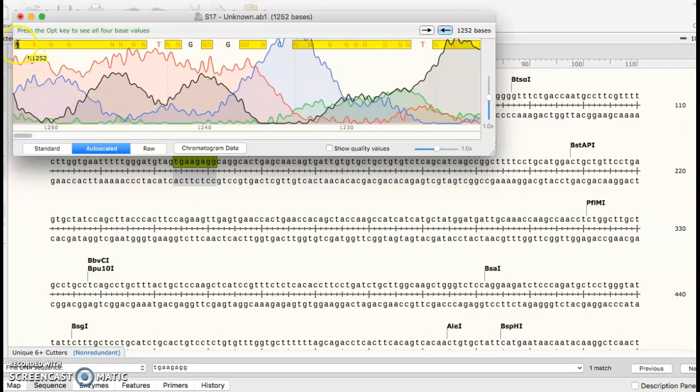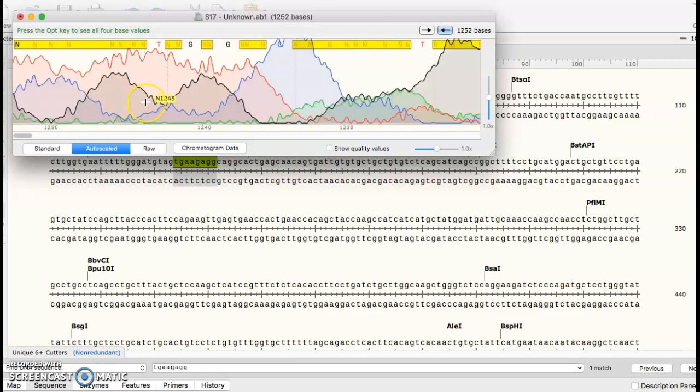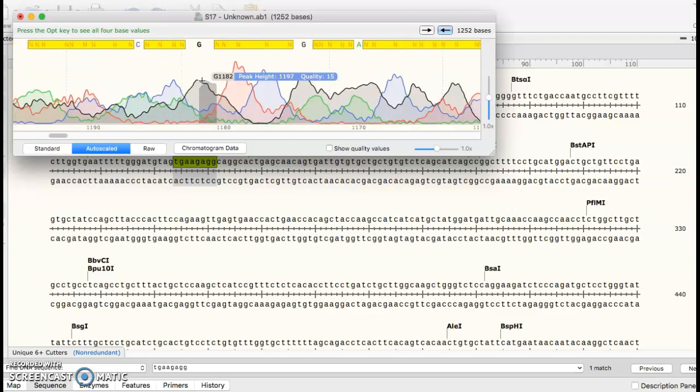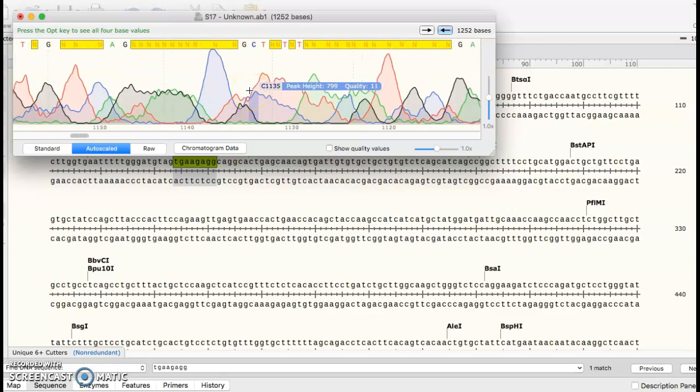When you've got all of this beginning portion of a sequence, you can see this is N, which stands for just any nucleotide. When the computer and their sequencing technology is going through and trying to sequence the data, the first 100 bases or so from your primer, downstream of your primer, are kind of junk. So we want to give ourselves plenty of space so that by the time we get to the portion that we want read really accurately, we're getting it.